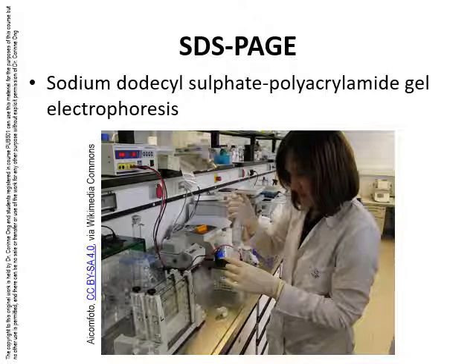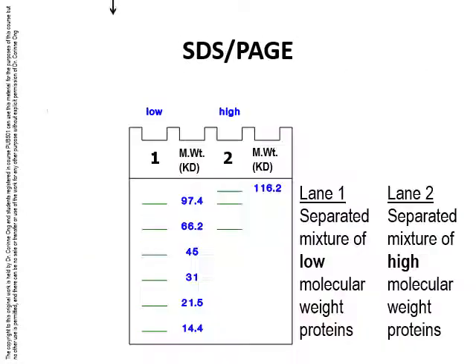I'm not sure what the laboratory worker is doing in this picture. Usually, the polyacrylamide gels are cast between glass plates, and because it is a polymerization reaction, the gels need a bit of time to set. It's a bit like making thin sheets of jello but in an upright position rather than flat. Then these are loaded into the buffer tanks before loading the specimens. Once this is done, the tanks are covered and the electrophoresis can proceed. Depending on the size of the tanks, this can range from minutes to hours.